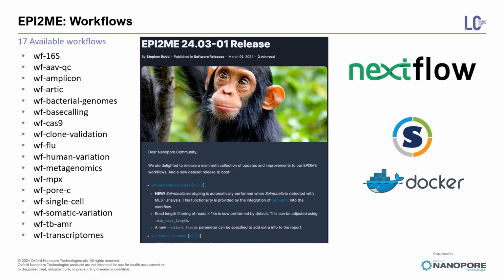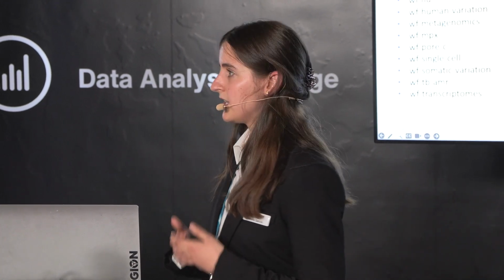We use Nextflow as a workflow management system to make the workflows run efficiently, and to ensure reproducibility, we package our workflows in Docker containers to manage external software. Currently, we have available 17 workflows that we are constantly updating, and also new workflows that will come.